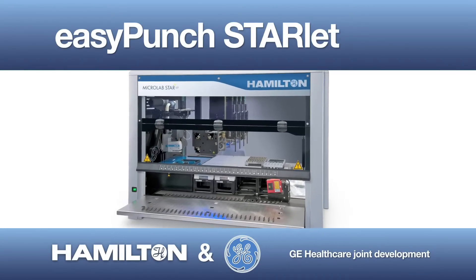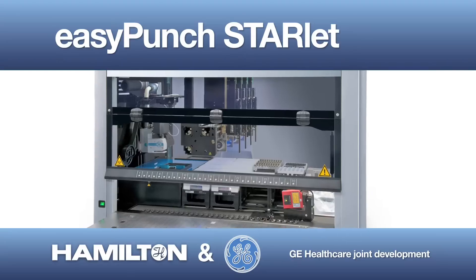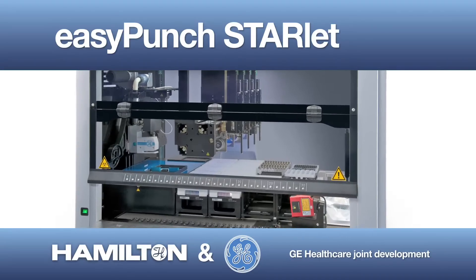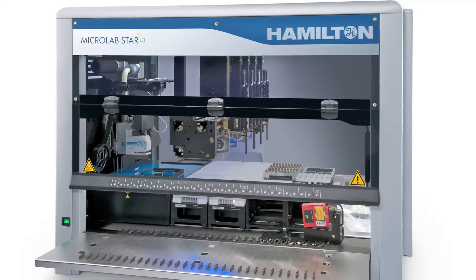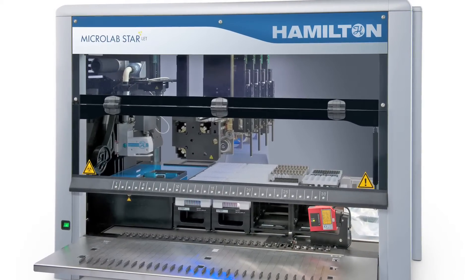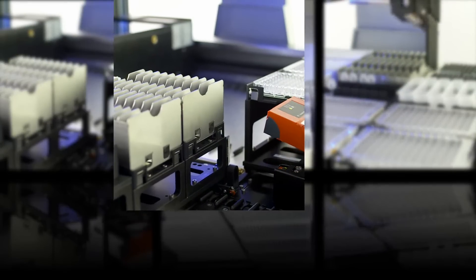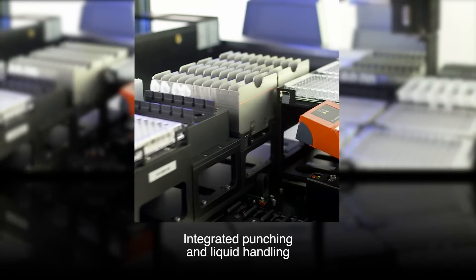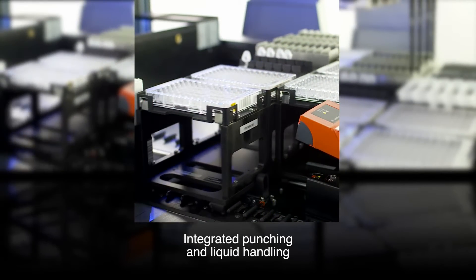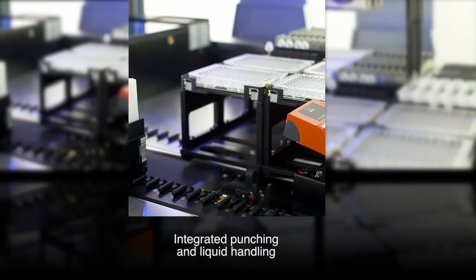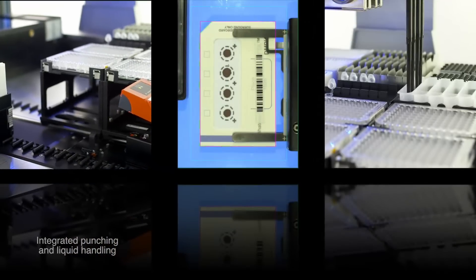EasyPunch is the first commercially available system integrating sample card punching and liquid handling into one automated workflow. It addresses the need for seamless integration of sample card punching with extraction, minimizing human errors, and enabling high throughput.